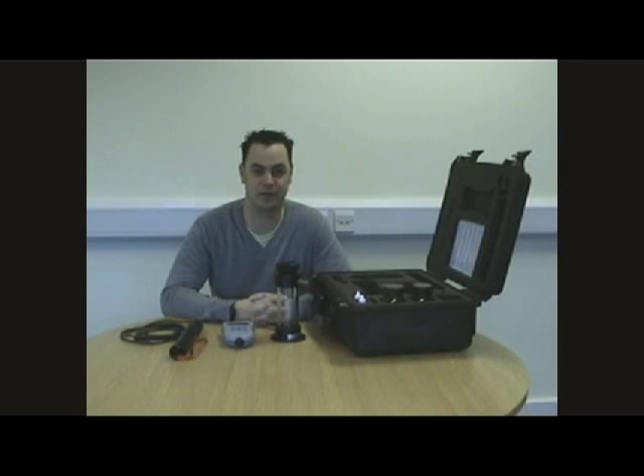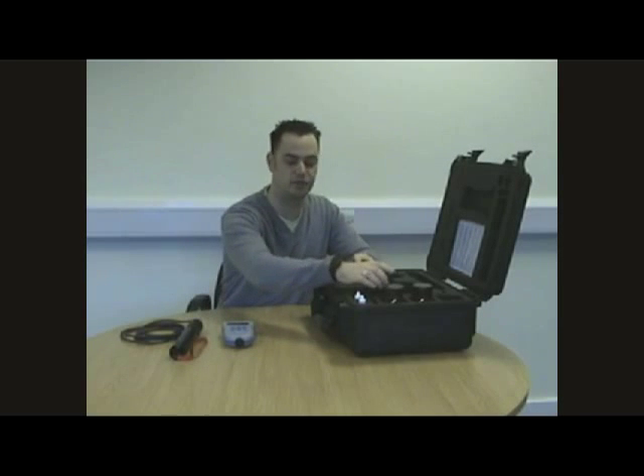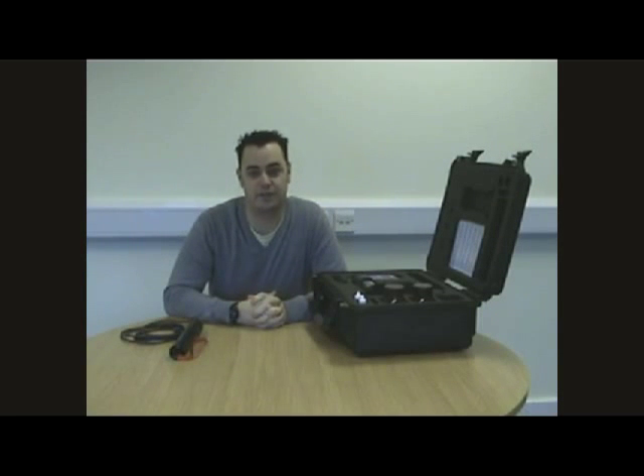Well there you have it. That's the GPS Aquameter and the AP800 Aquaprobe from AquaRead. We also offer a full range of accessories to complement these products, such as the rugged flow cell and the rugged hard case. The rugged hard case is great to keep all your instrumentation in the same place and keep it safe while you're on the move. For a full list of our products, please visit our website at www.aquaread.co.uk. Thanks for listening.